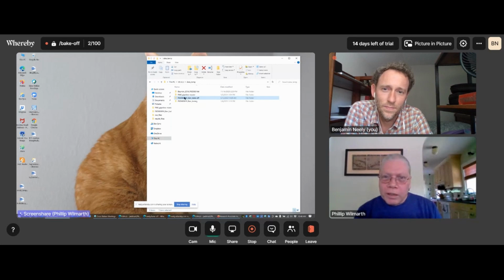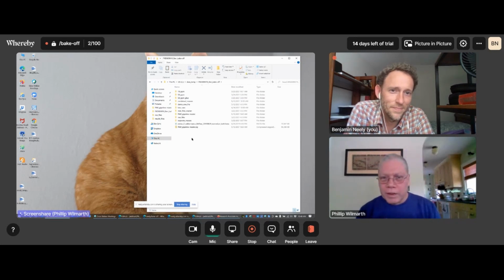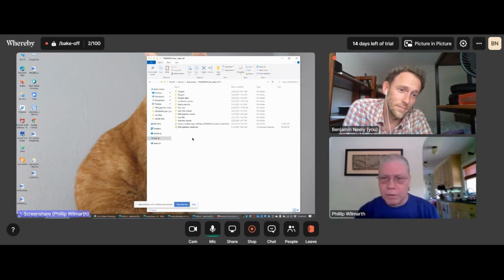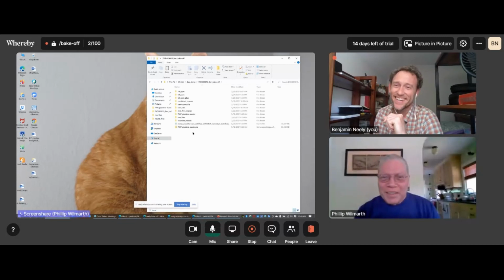Okay, so I made a little folder here with California sea lion data, and at some point here I'll show that we've got a full data analysis repository just for this data set. It's available on GitHub. So if you're interested in this, you can check out that repository and also see the spectral count quantitative comparison. I mean, I'm a big fan of the California sea lion. It's a fun data set.